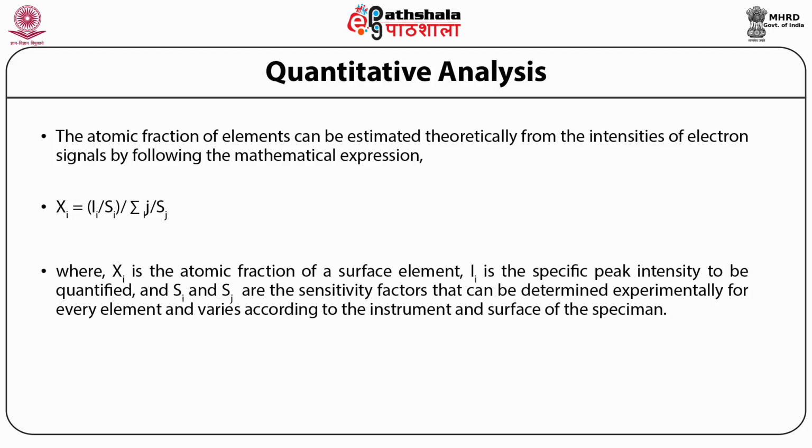The quantitative estimation using this equation is based on a few assumptions and approximations. Caution needs to be exercised during calculations to prevent erroneous results.